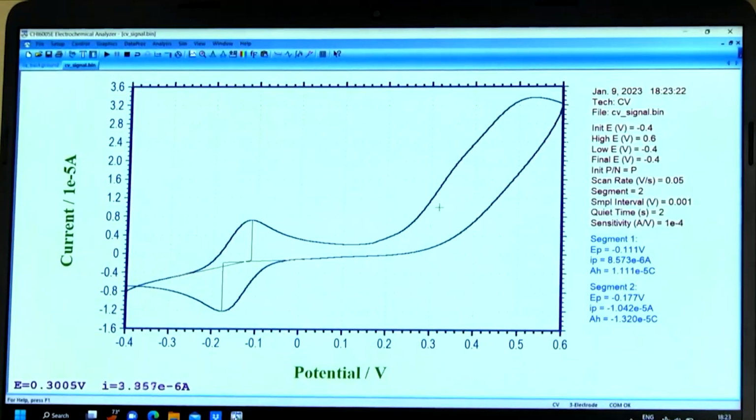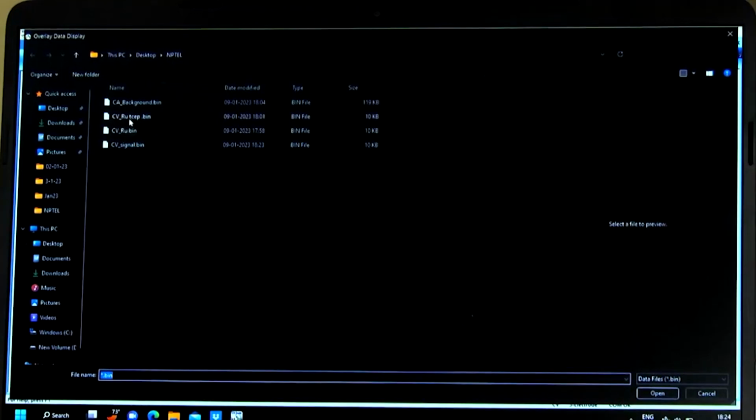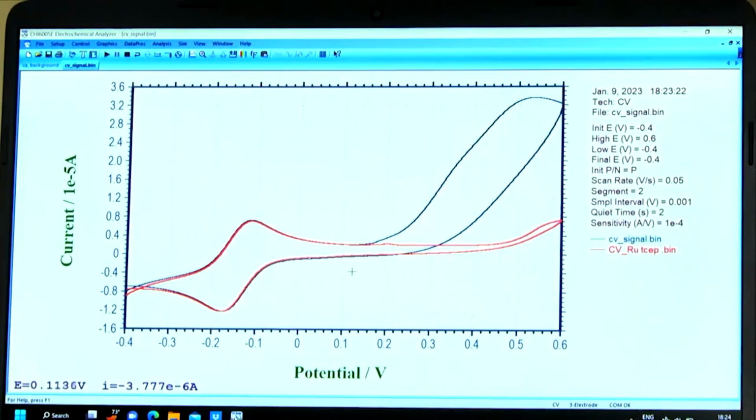Okay. So you see, these are the two distinguished peaks, hydroquinone and your ruthenium. So they are actually reacting with each other, that we can observe if we take the chronoamperometry. So let's compare here. Just only your ruthenium, you can see there is not that much difference here. Your difference actually came on this side, and we want to check their reactions more than your ruthenium potentials, and we have to find out which potential is best for this reaction.